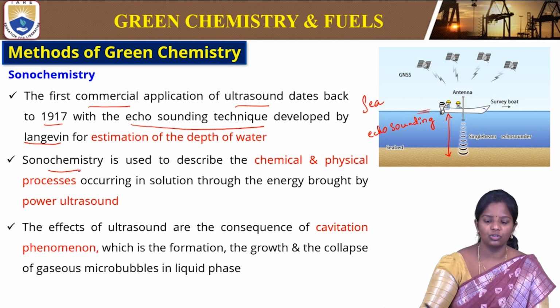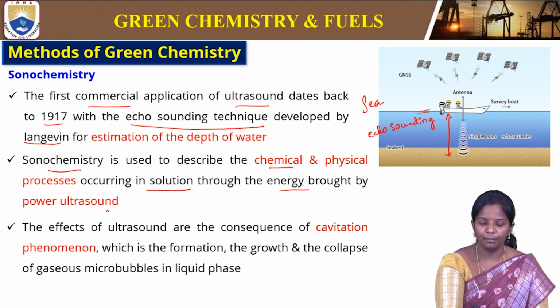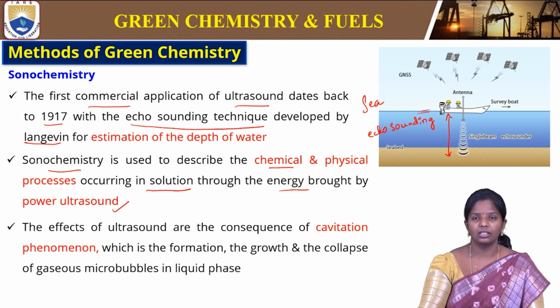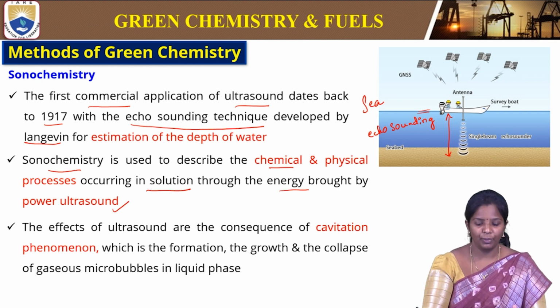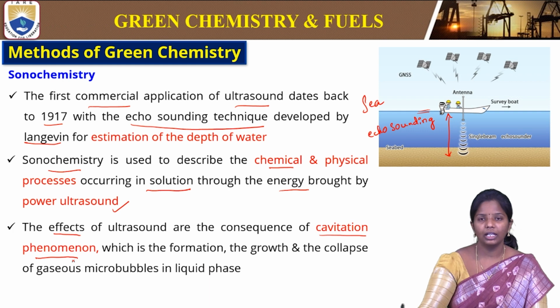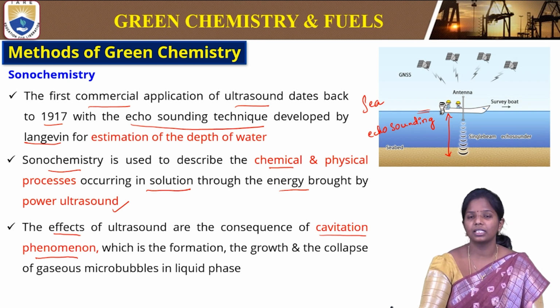So sonochemistry is used to describe physical and chemical processes occurring in solution through the energy brought by power ultrasound. Whenever ultrasound is used, it generates some energy. Using this energy, some chemical or physical processes take place in the solution. That is how sonochemistry comes into play. The effects of ultrasound are the consequences of the cavitation phenomenon.